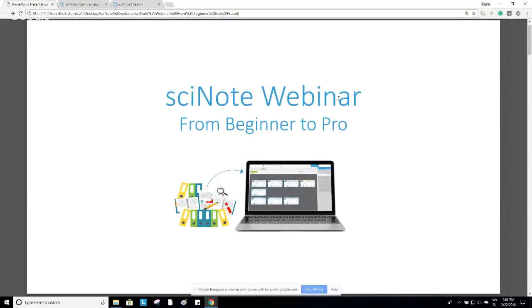Hi, everyone. So the purpose of today's webinar is to go through SciNote basic functionalities and to learn more how you can use it for your research work. I will now share the screen with you.